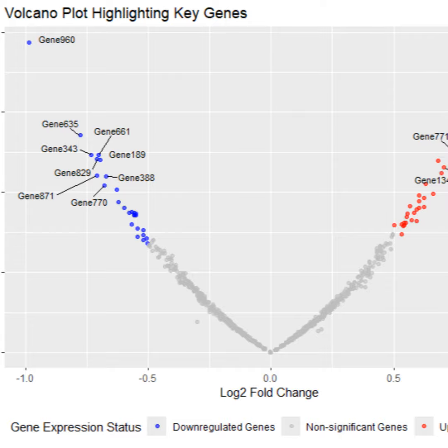So it's like setting your spam filter to be super aggressive and accidentally filtering out important emails? Exactly. On the other hand, setting the threshold too low could lead to a flood of false positives, making it hard to separate real signals from random noise. So finding that sweet spot is crucial for getting meaningful results.